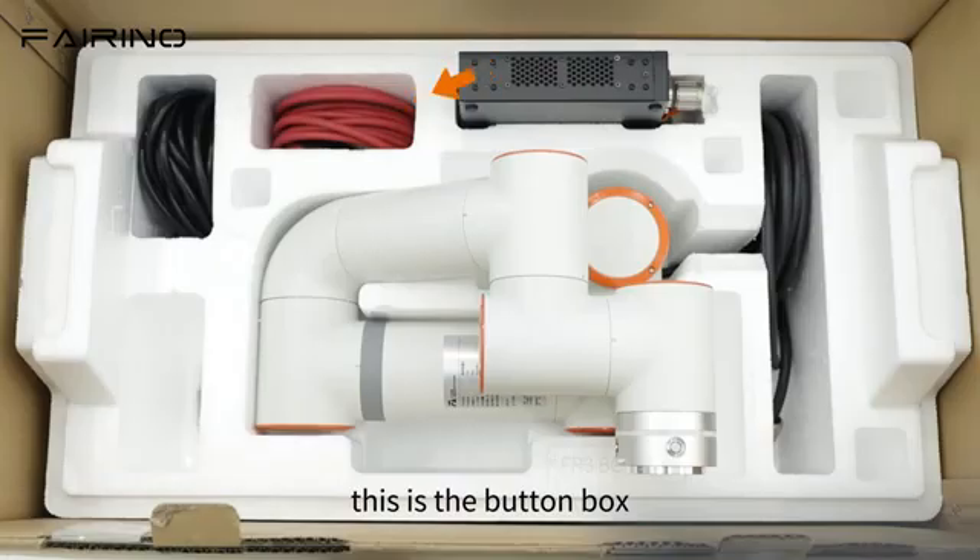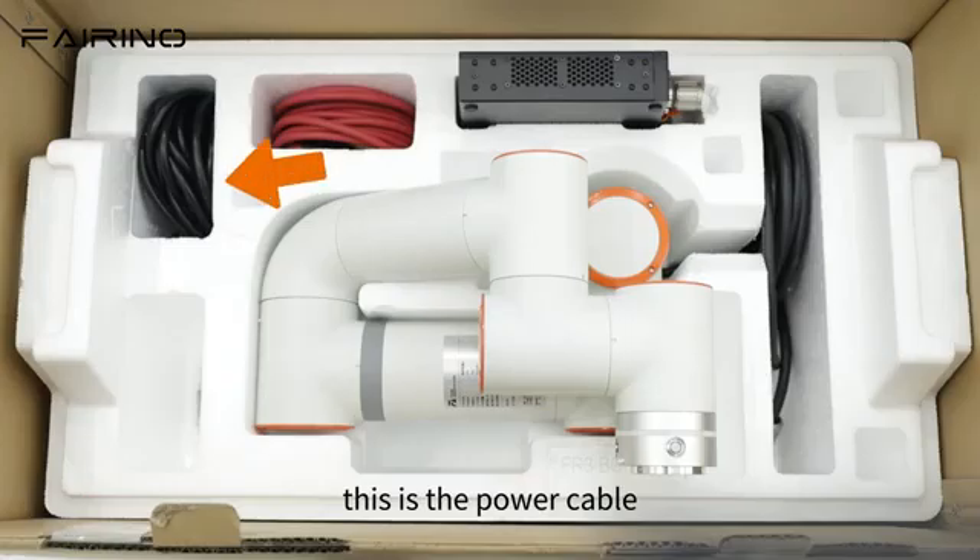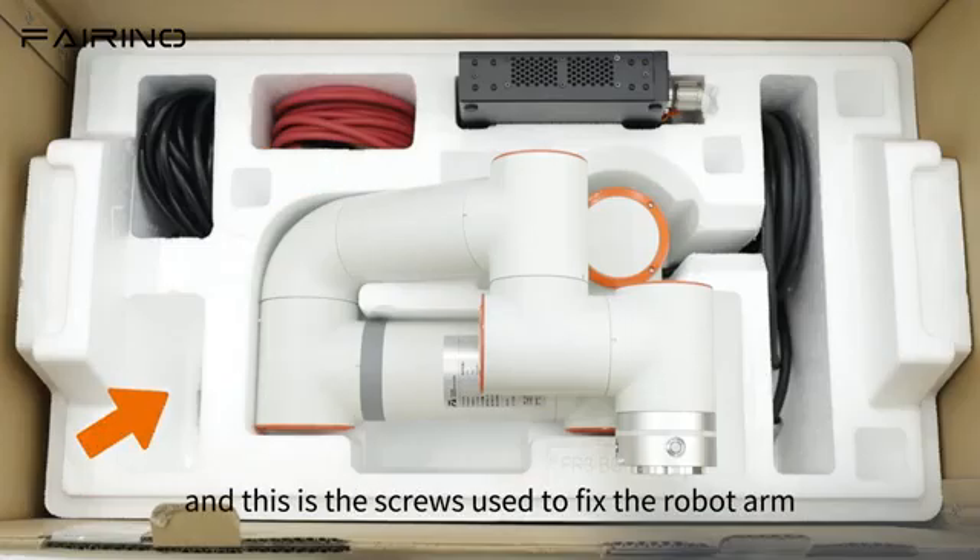This is the robot arm, this is the button box, this is the control box, this is the robot control box cable, this is the power cable, and these are the screws used to fix the robot arm.